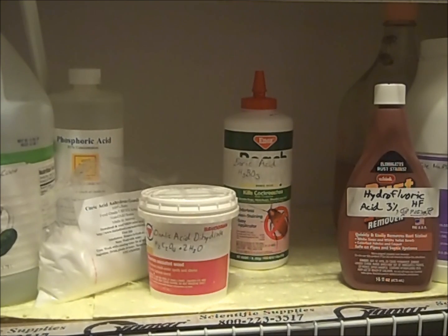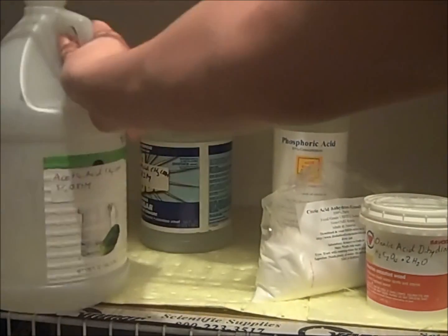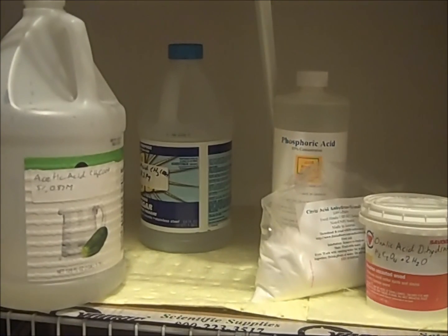In the bottle with an applicator tip at the back is boric acid. This is sold as a roach killer under several brand names and occasionally by name. The large bottle contains food grade vinegar, which is about 5% or 0.87 molar. This is safe for consumption and generally has sugars and many other impurities in it. If pure acid is desired, one should purchase Top Job cleaning vinegar from places such as Walmart. This is marketed as an environmentally friendly way to clean, and the concentration is about the same as the food grade vinegar, although it is much purer because it does not have sugars and whatnot.